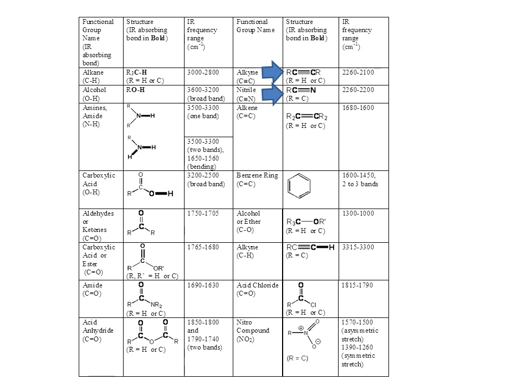So when you detect a peak or a band in that region, you just say to yourself, well, I either have C triple bond C or C triple bond N. And you let other information about the molecule, the presence of a nitrogen, and other structural features, other infrared data, narrow down the possibilities so you can determine whether you have C triple bond C or C triple bond N. Just having a peak in that region will not tell you which one it is.